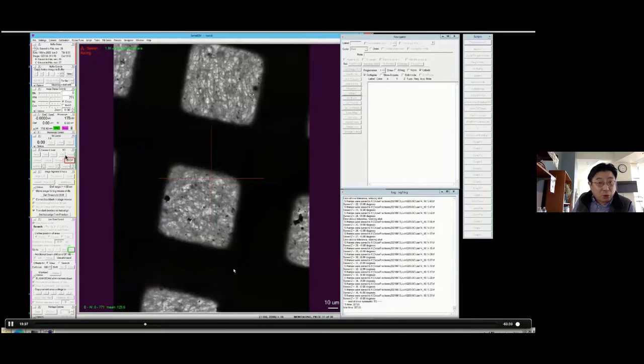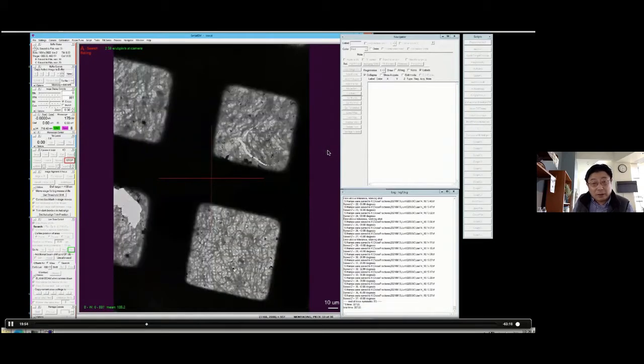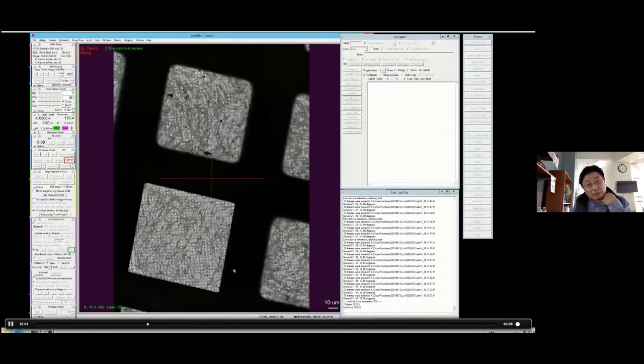And this record and focus really depends on your interest. For example, if you want to get a very high resolution, you use a very high mag. In this case, the record is 64K. So it's very high mag. It's almost like single particle data acquisition. Okay, so we are almost there. And so this is why you need patience, and hopefully you don't waste much time.